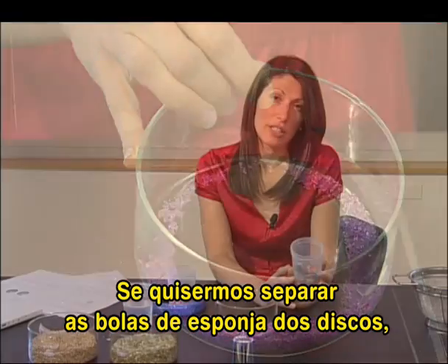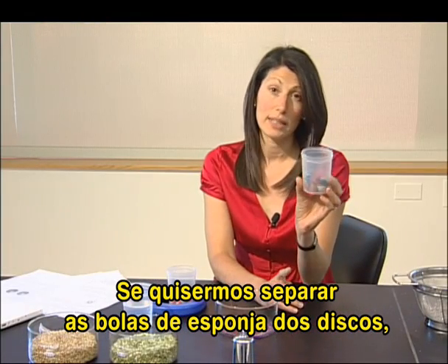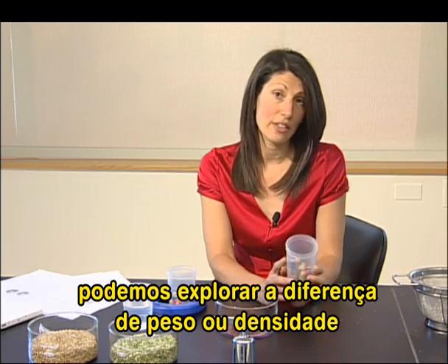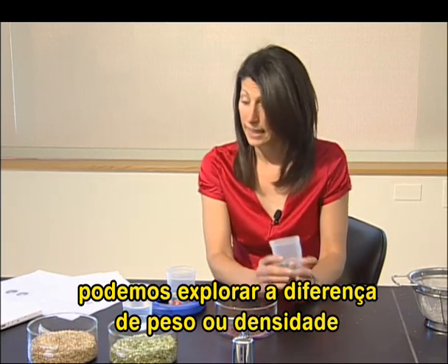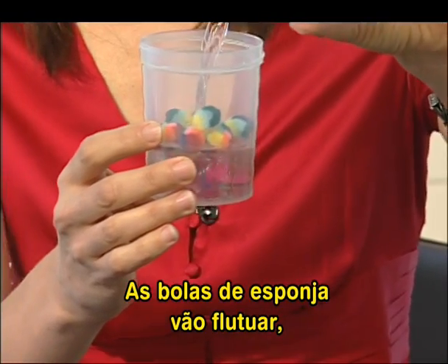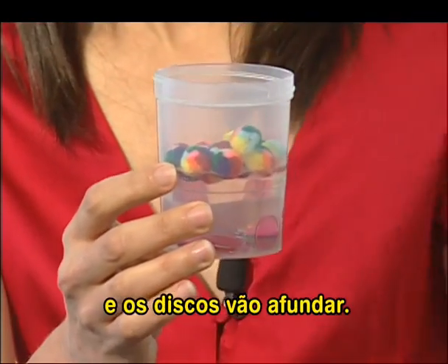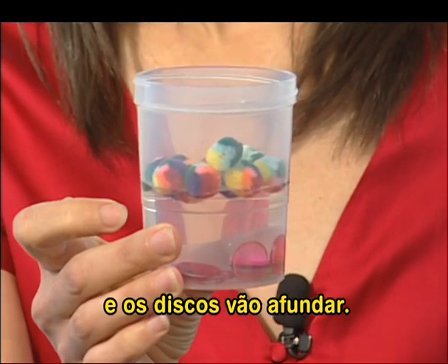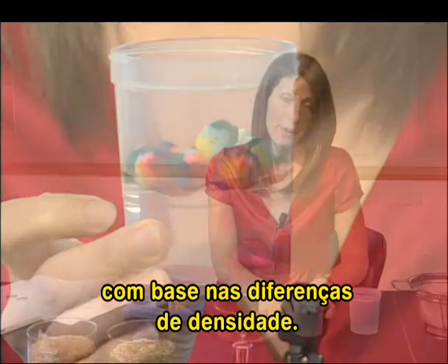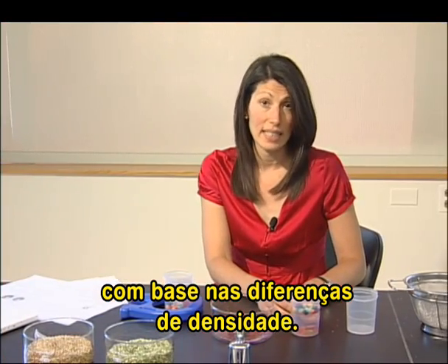Then if what we wanted to do was try to separate the puffballs and the discs one from the other, I thought we could try to exploit the difference in their weight or their density by maybe adding some water with the puffballs floating and the flat discs sinking. This would be, if we were separating proteins out from a cell, separation based on differences in density.